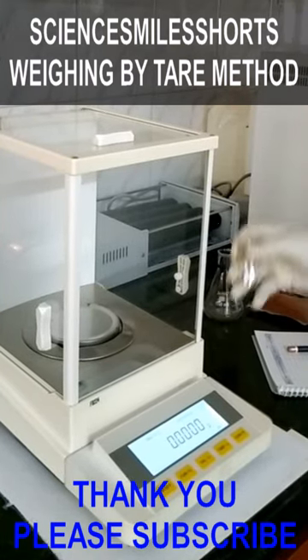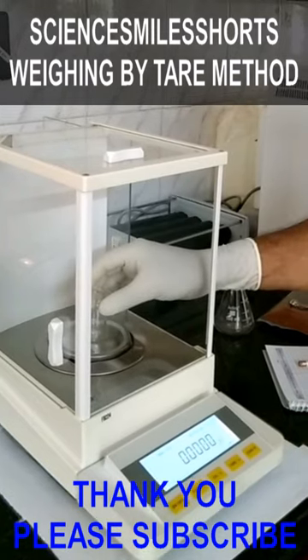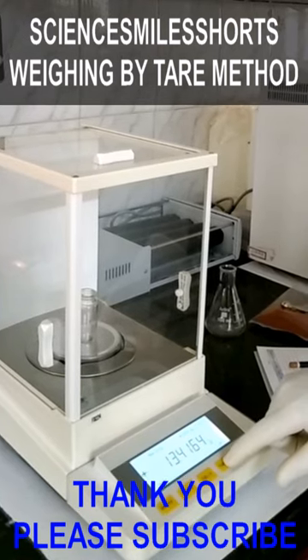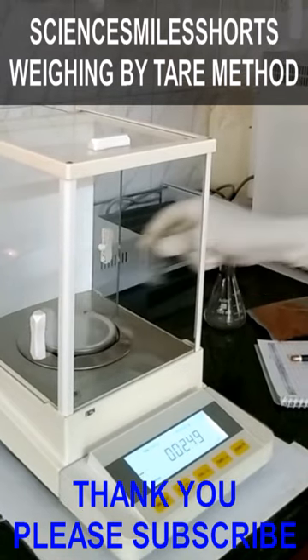This video shows weighing by tare method. Many balances are equipped with a tare option. Taring nullifies the weight and sets it to zero on the balance. The method is very fast.